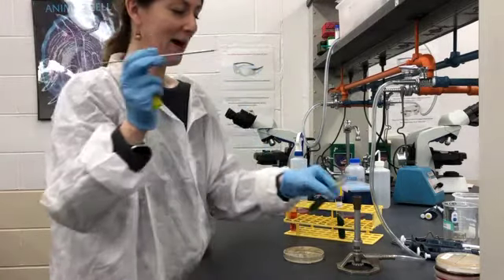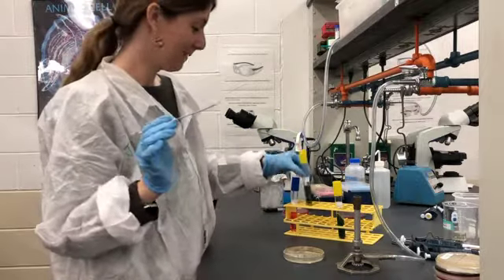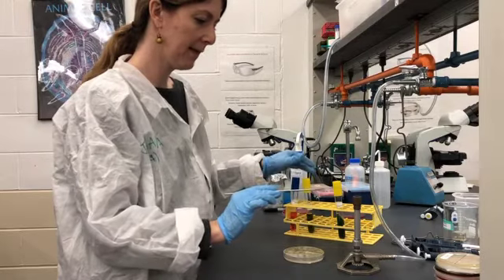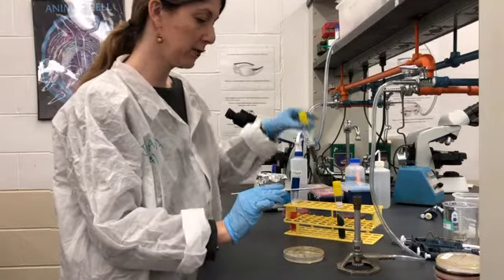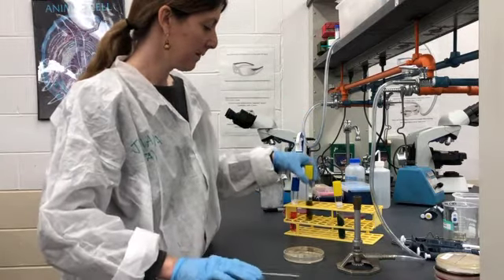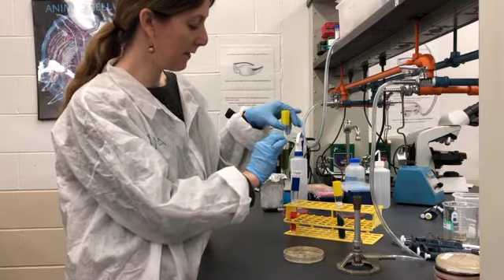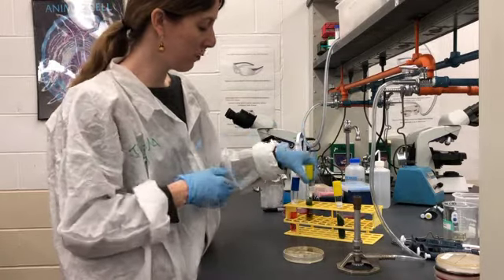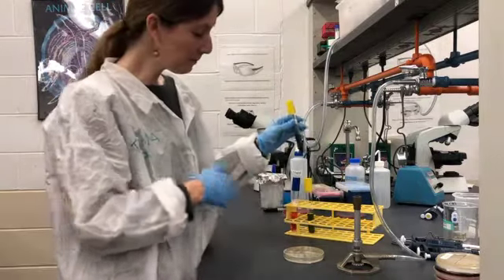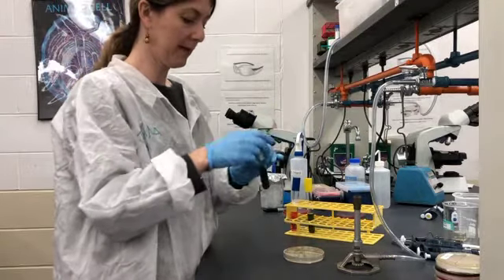And again, my apologies, I forgot to flame the lid. And again, sterilize. So that is the semi-solid media. Remember, with the OF glucose, we're going to do this in duplicate, and then one of the tubes is going to get mineral oil on the top to create a less oxygenic environment, while the other one will have access to oxygen. So we can compare and contrast how the microorganism breaks down glucose in those two environments.